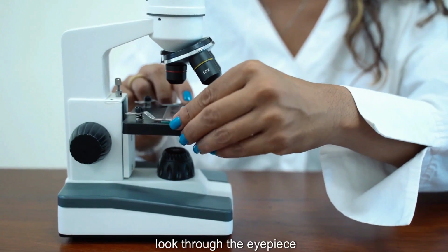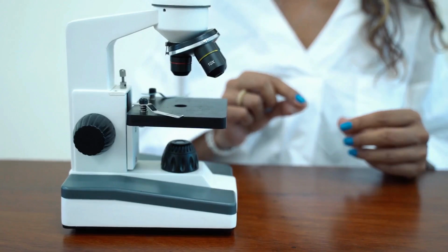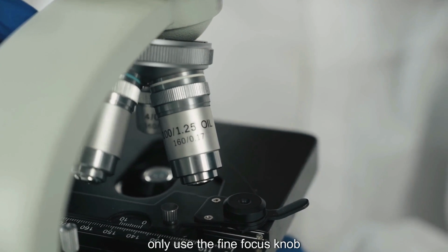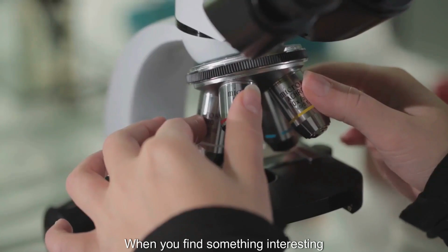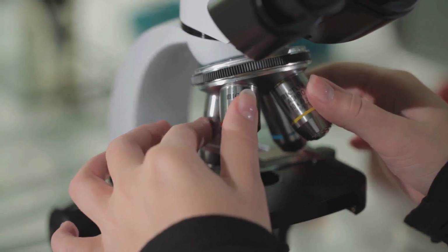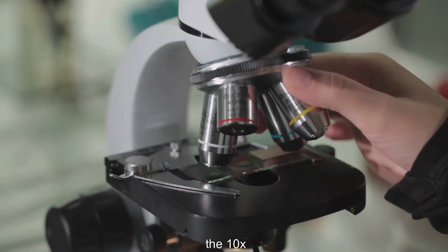Now, look through the eyepiece. Slowly, very slowly, turn the coarse focus knob towards you. The moment you see anything at all, stop turning the coarse focus knob. From this point on, only use the fine focus knob to make the image perfectly sharp. When you find something interesting, move the slide so the object is exactly in the center of your field of view. Without touching the focus knobs, carefully rotate the revolving turret to the next objective, the 10x.